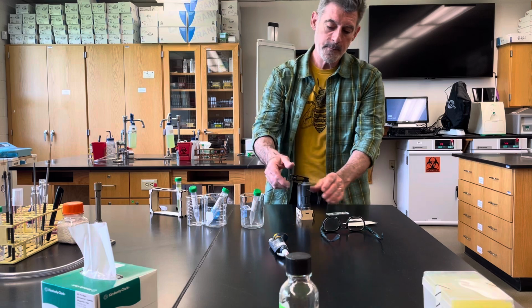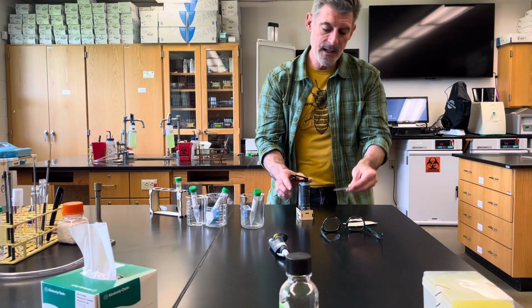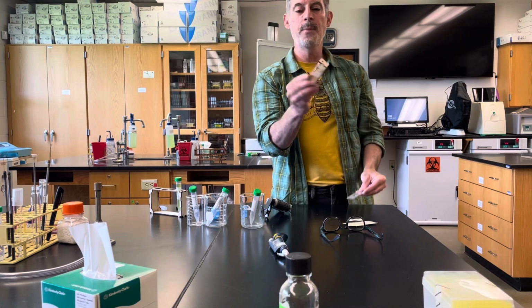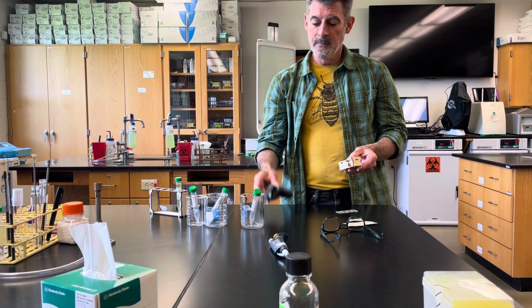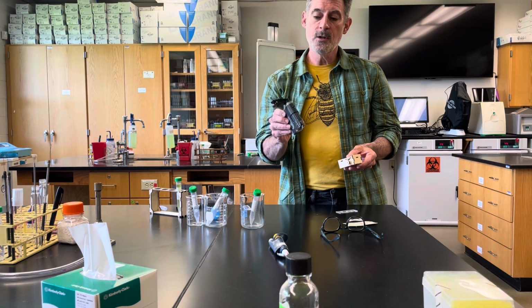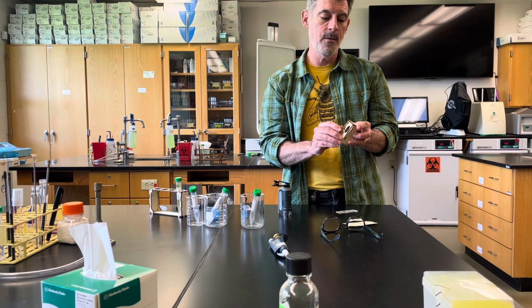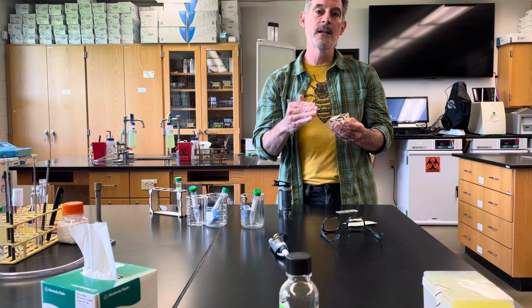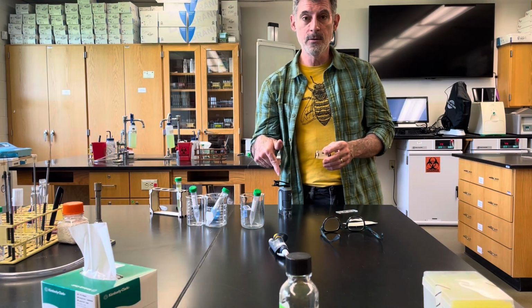So I'm going to go ahead and get my camera, attach it on here. I'm going to take the slide. Remember, there's a little in this microscope base. Now, these bases are unique. We handmade these for the classes to go along with these microscopes. The scopes work okay without the base, but the idea in microscopy is this mirror underneath here will change the angle of light, and the angle will change the contrast of what you're viewing through the microscope.